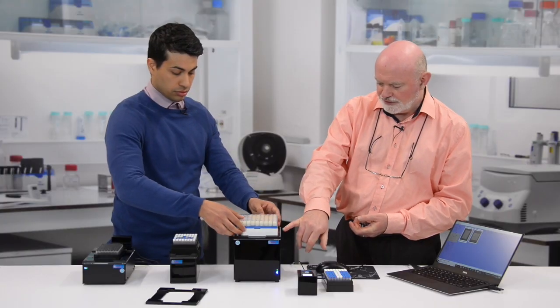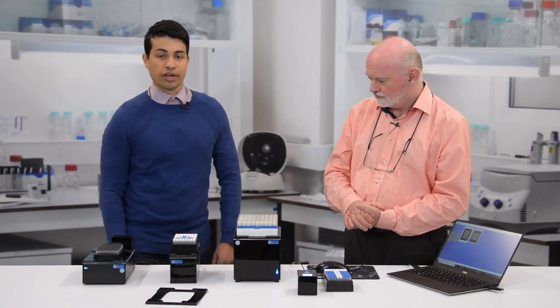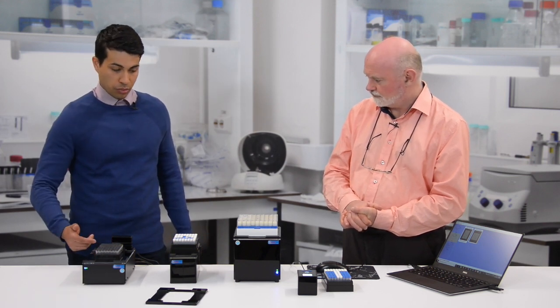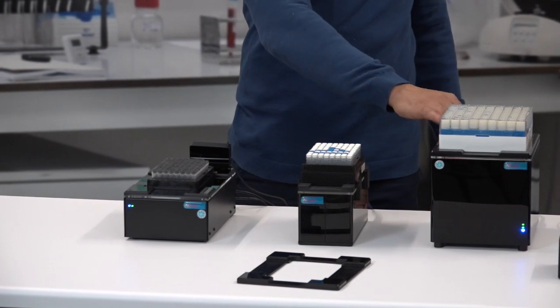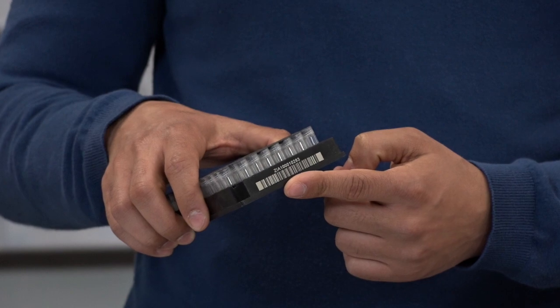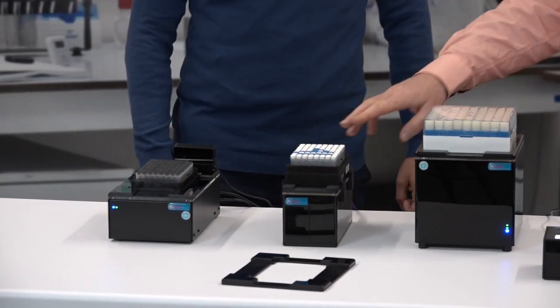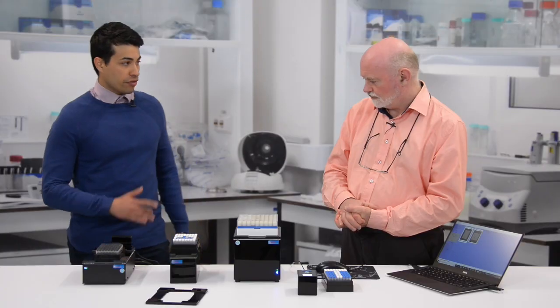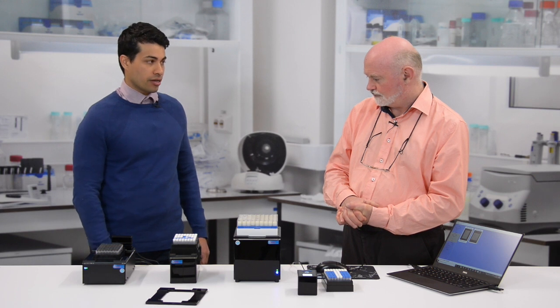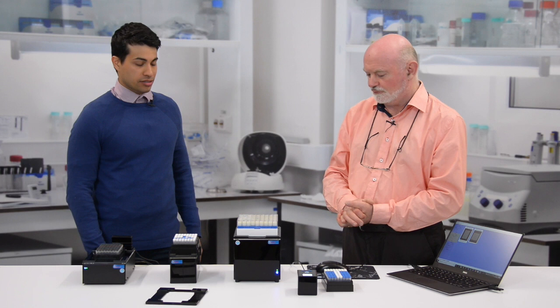If I want to read the linear barcode on a particular rack, can I do that at the same time? Yes — you can do that with the 1DR2 scanner on the side of the rack, shown here on our Mirage. It's currently not on the Cube, but the 1DR2 can be fitted to the Express and the Cube as well — in fact, across our full range of scanners — using the appropriate bracket.